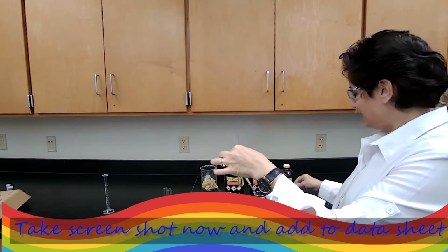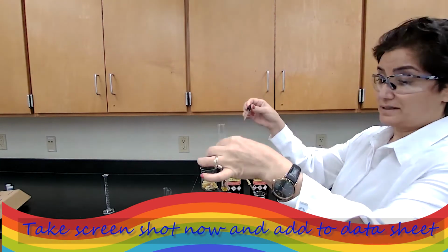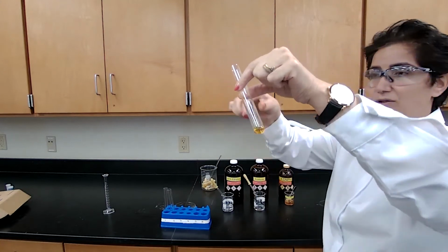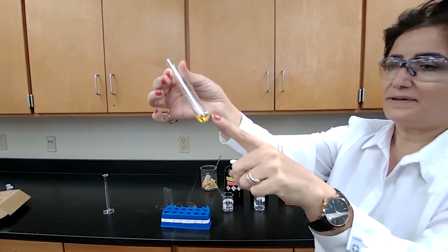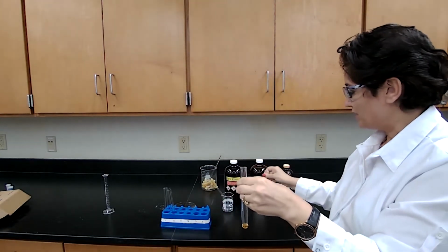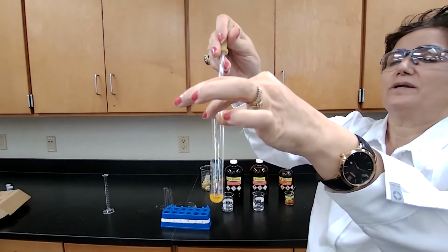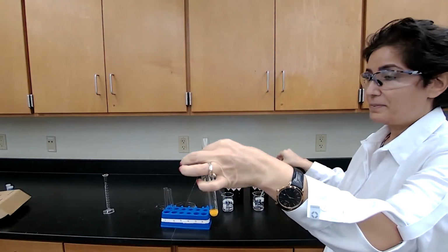So I'm adding the DNP first based on the procedure. Then I'm going to add a few drops of the acetone to this solution. So this is a yellow color, but still a solution. If it precipitates, it would turn cloudy. So that's what we are looking for, formation of a cloud, a cloudy mixture. So now it turns cloudy. This is a positive test.